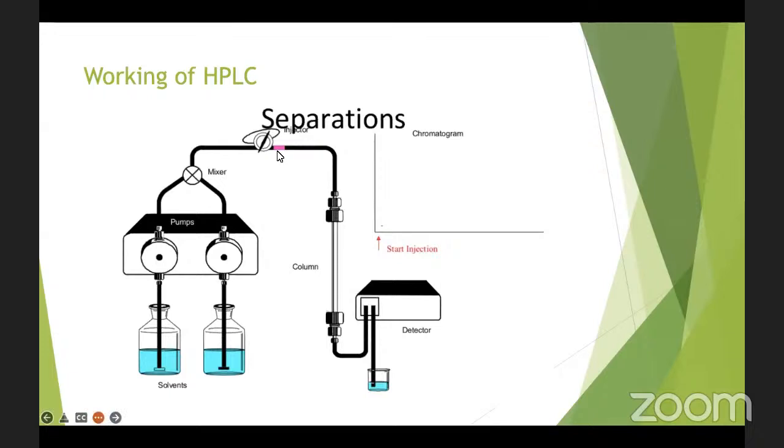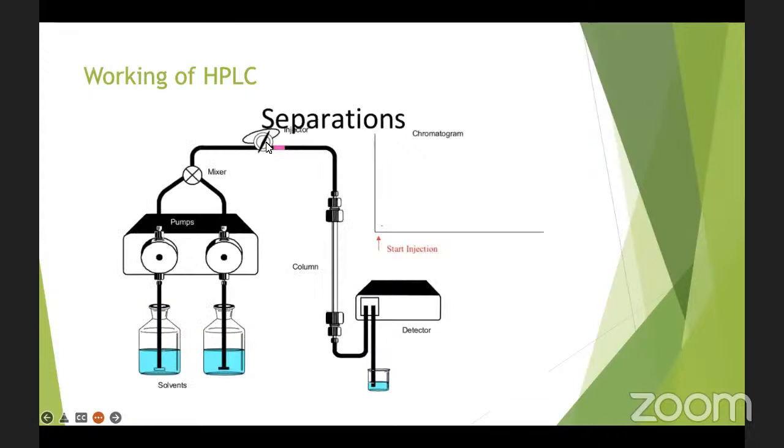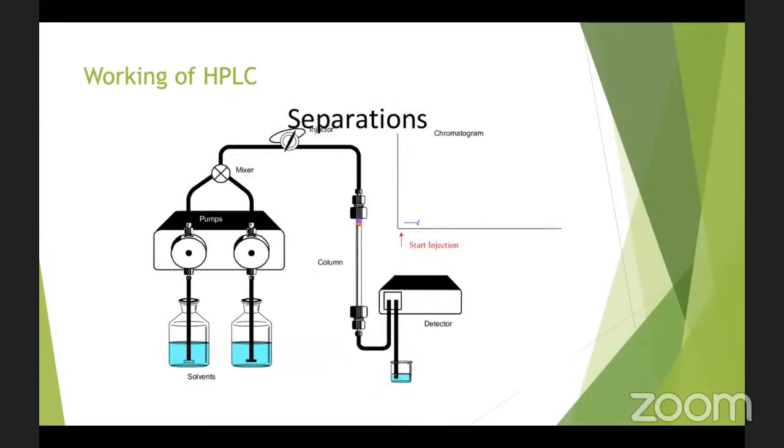The mobile phase carries the sample through the stationary phase and moves through the column. Here the sample has been injected, which was not there in the previous one, and the HPLC process has been started. Now the sample has started moving and the mobile phase has reached the column. We see a small line here. This is the chromatogram, which represents the whole process going on in HPLC. As soon as the mixture enters the analytical column, it starts to separate and we start to see some peaks of the components that were dissolved in the liquid mobile phase and have come to the detector.